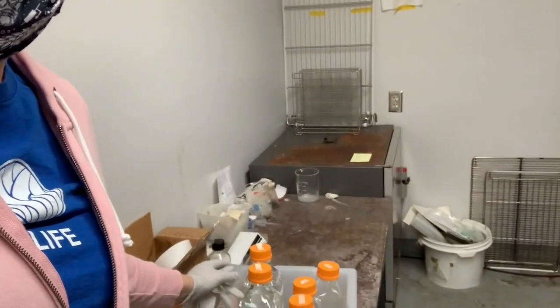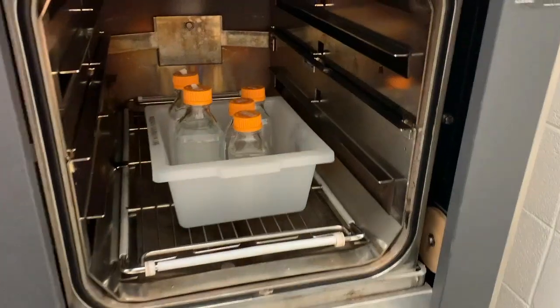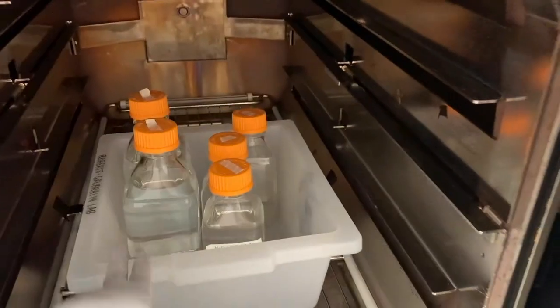I have gotten my bottles ready. So I've brought them up here and I've given them a little bit of a turn so that they're maybe half a turn from being totally closed. I'm going to put this tray into the autoclave and then show you how to autoclave. Okay, and there is my tray and my bottles.